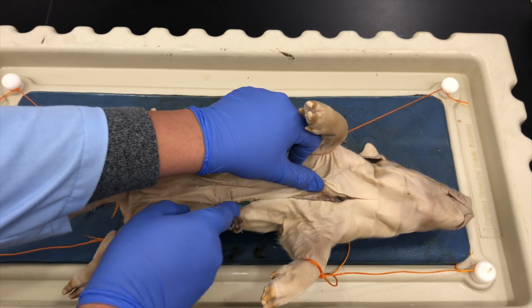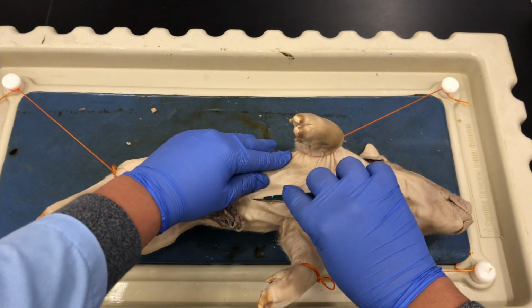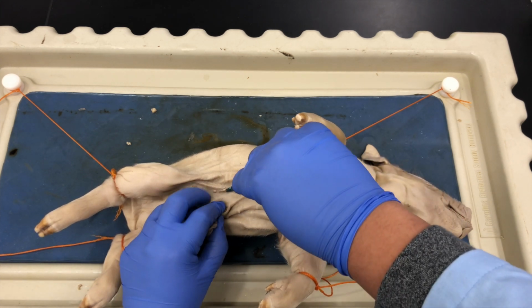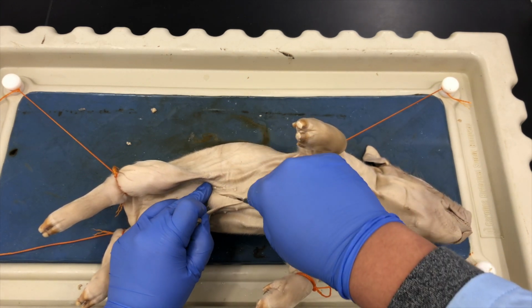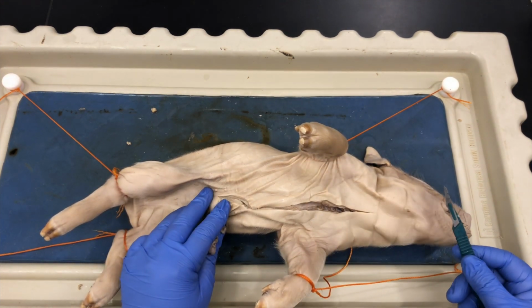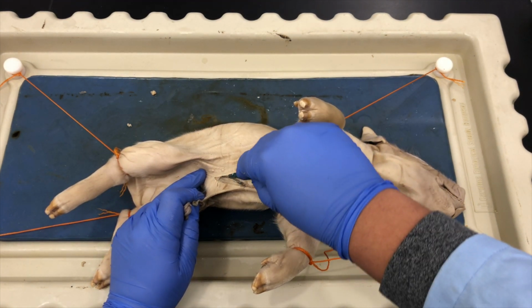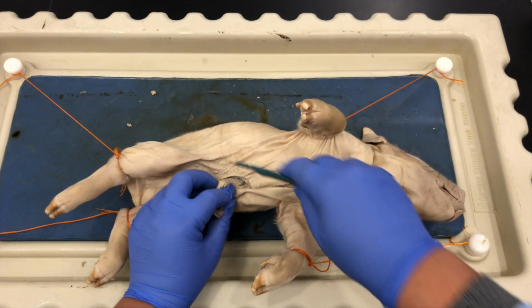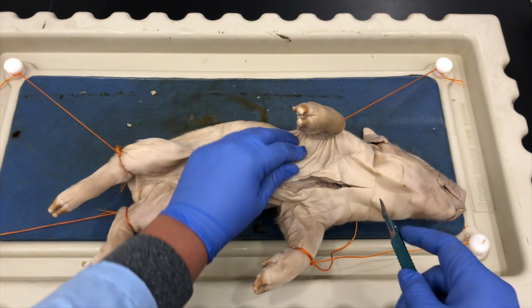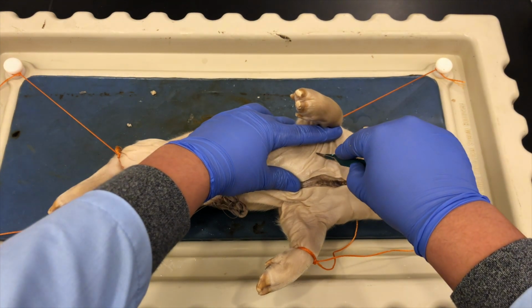Next, from that center cut, I went down close to the umbilical cord, again being very careful not to cut through too much tissue. I cut around the umbilical cord slightly with this first cut. Now with this next incision, I went towards the forelimb.